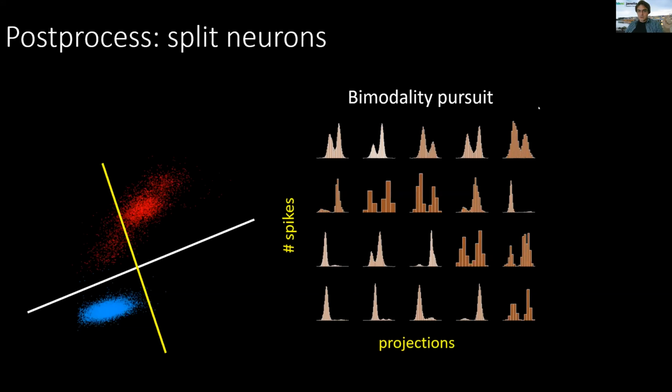But now it actually requires Kilosort 2 to process the data sequentially and track neurons over that gap in time between the two recordings. So things get a little more messy with chronic recording, especially if you have many of them you want to align to each other. That's still ongoing work that we're trying to fix, but it's quite a bit more difficult.